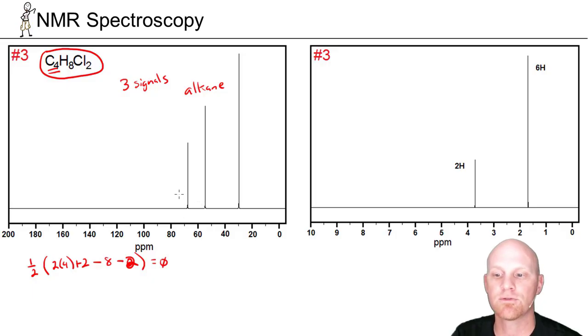All 3 of these signals are down here in the alkane region. Some of them are pretty far downfield in the alkane region, so there's probably some that are bonded to electronegative atoms, like the 2 chlorines in our structure in this case, but still all in the alkane region of the spectrum.